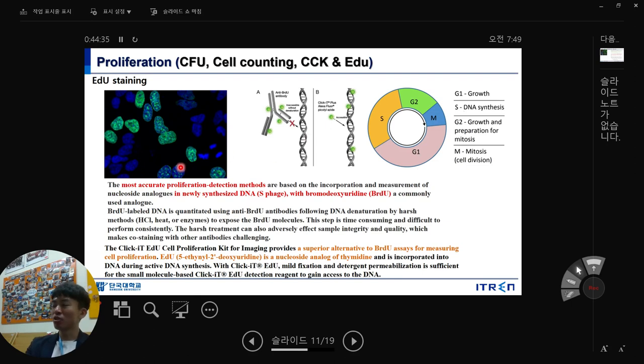You can do. So this means that when you change the EdU staining time, like 2 hours, you can see within 2 hours how your cells proliferate, how your DNA converts to double. If you culture with EdU dye for 4 hours, or for 8 hours, from that time point you can see how their DNA is doubled. So this is a really direct assay to check proliferation. Okay? How the S phase is involved in your cell fraction.